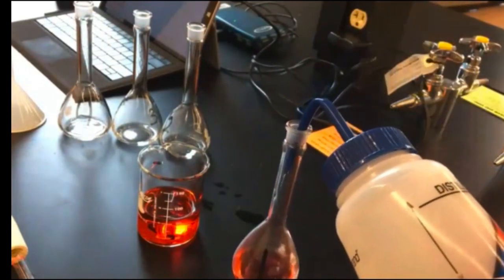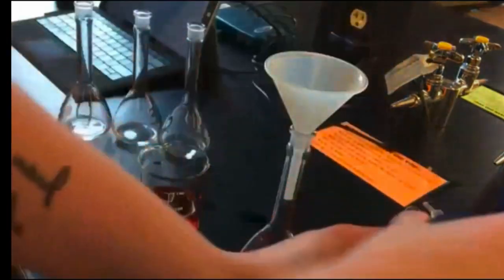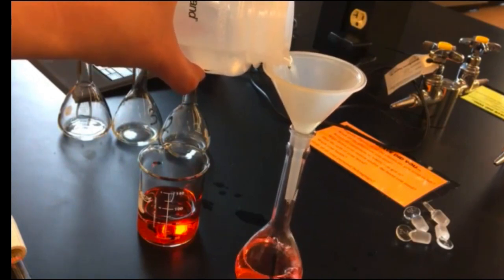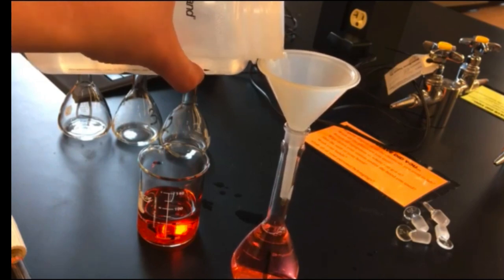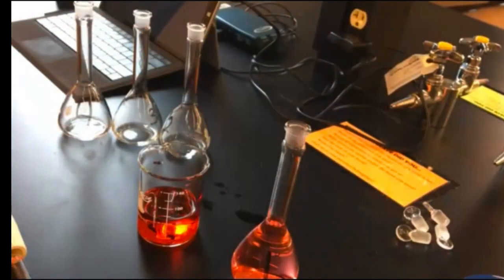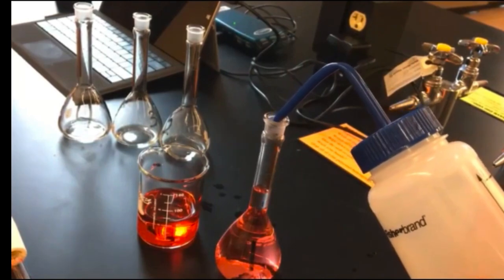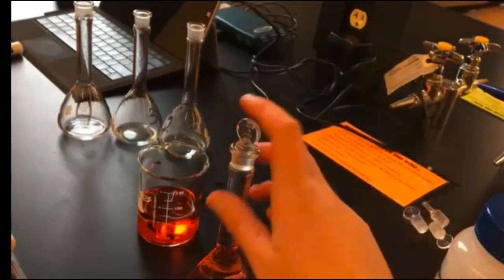And we're going to continue to add water, to quicken the process. There's my funnel. I'm going to dump some until we get back to the neck. Meniscus. I'm going to take a stopper and do what we did with the stock. Mix it up a little bit. So that's how we're going to make our dilutions.